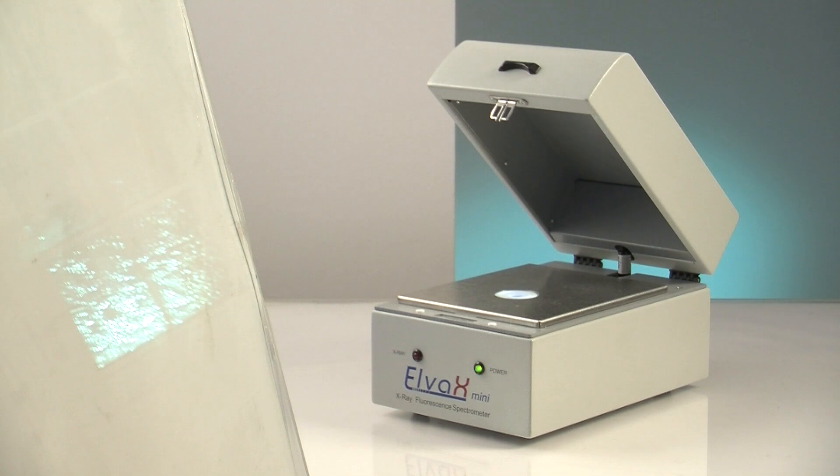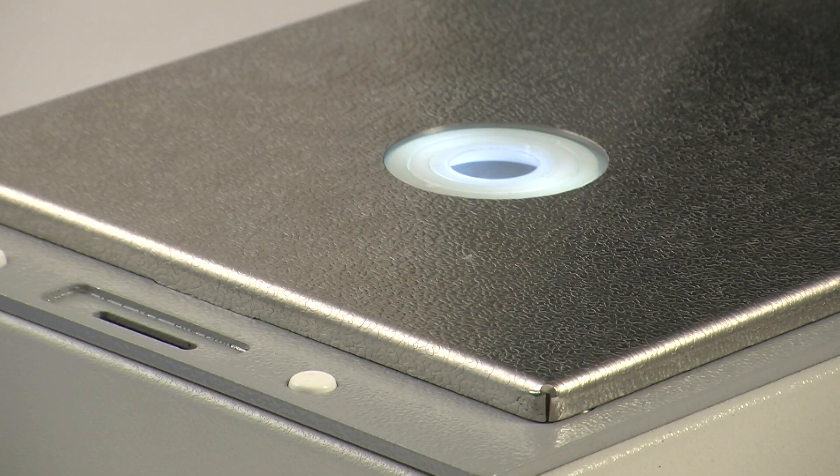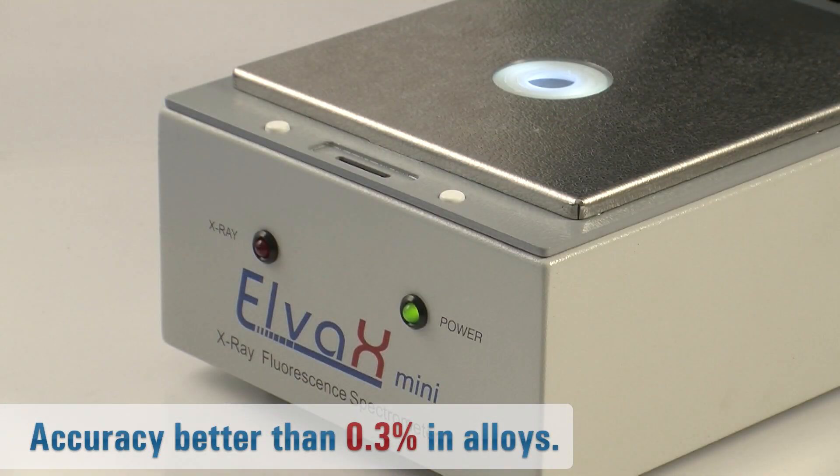Apart from precious metals analysis, Elva X-Mini is suitable for analysis of other metal alloys, RoHS compliance testing, and other applications. With a detectable range of titanium to uranium, Elva X-Mini delivers accuracy better than 0.3% when measuring metal concentrations in alloys.